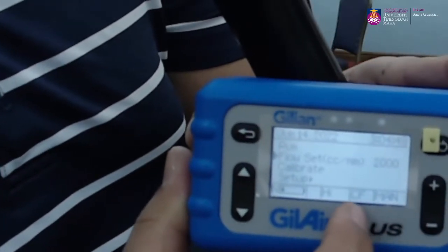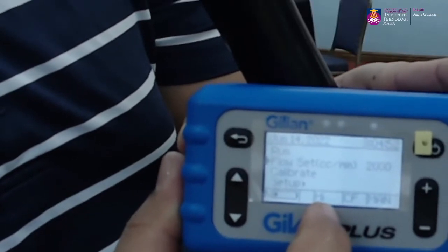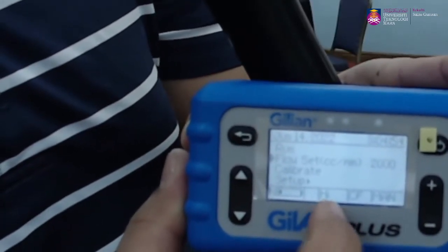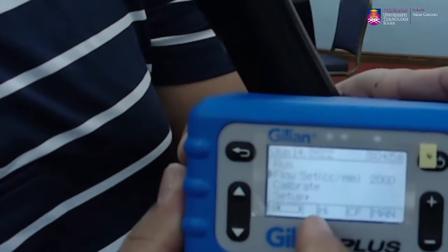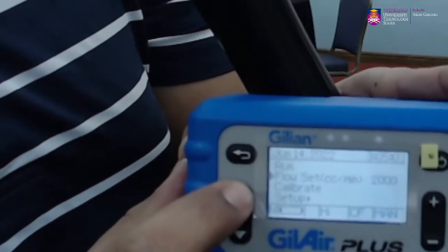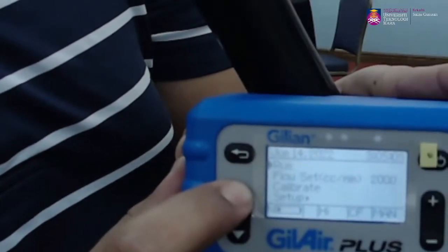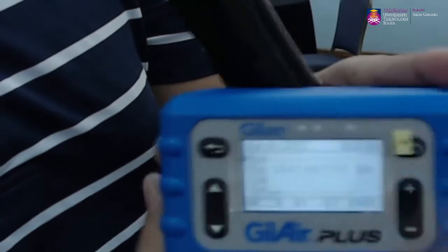And then ensurekan yang kat bahagian bawah ni ialah high. Kalau dia lebih daripada 450 cc per minute, then kita kena make sure ke high. Okay. So daripada situ kalau kita dah setkan semua appropriately in terms of high and also kita punya flow rate, just scroll ke atas ke bahagian run and then kita just boleh start.